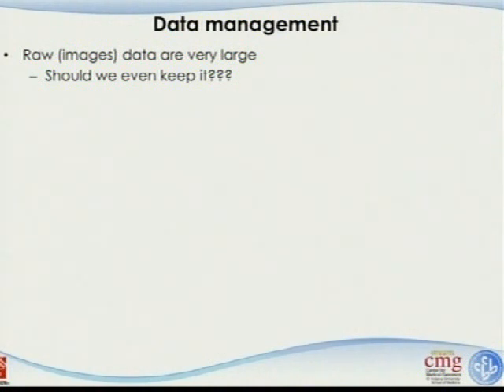And there's a problem with that. The major problem is when the sequencer company updates their software to derive the base call from the raw image, your later calls and the earlier calls, before and after the switch, are not comparable anymore. That happened once for Illumina, with the version change from 1.3 to 1.4. A lot of institutions were really panicked at that moment.